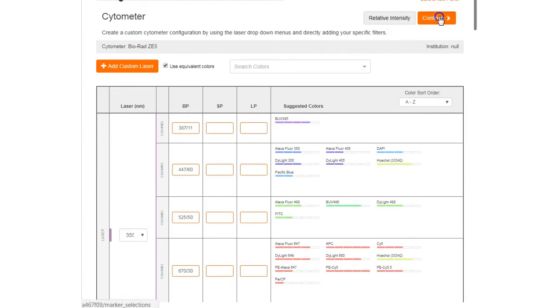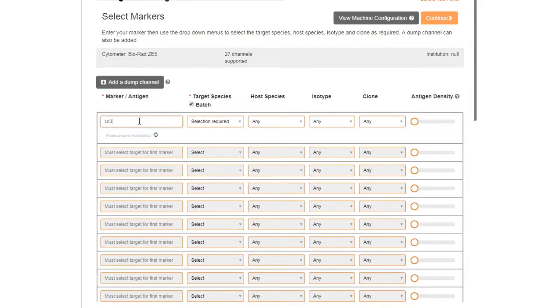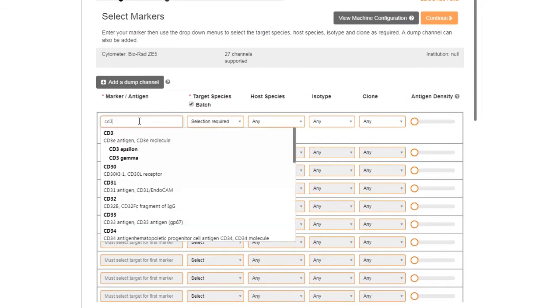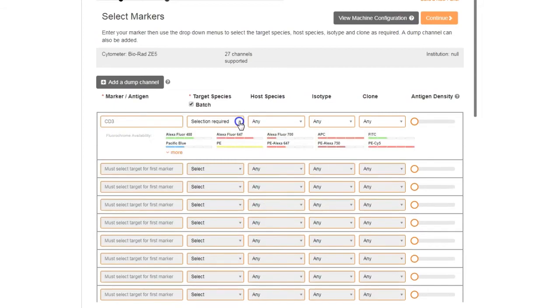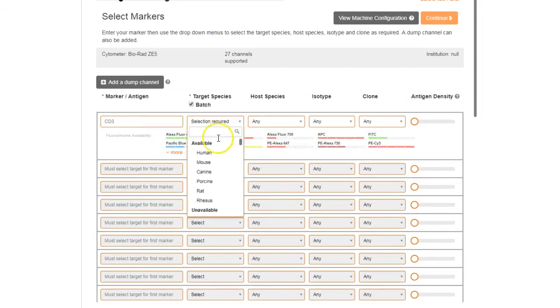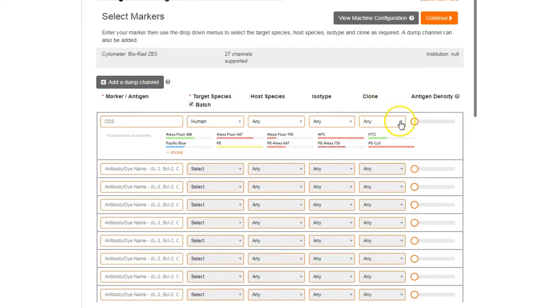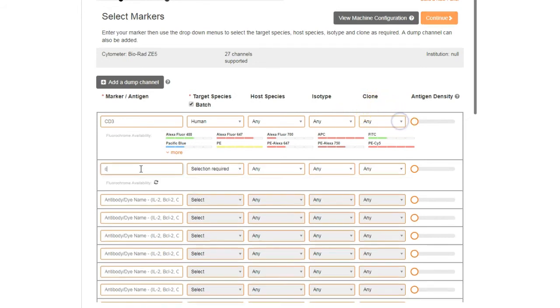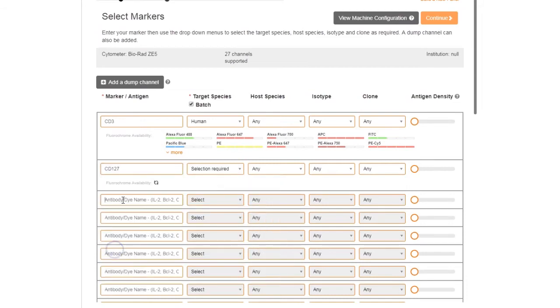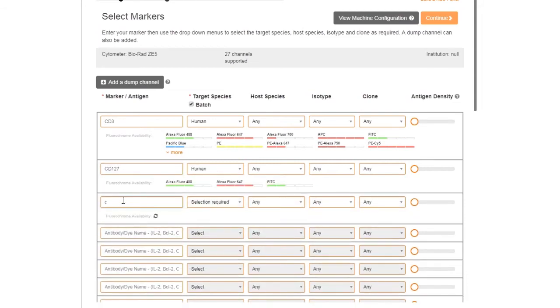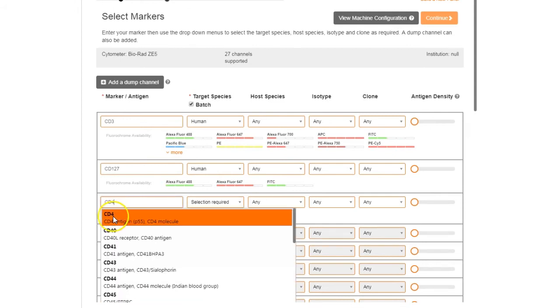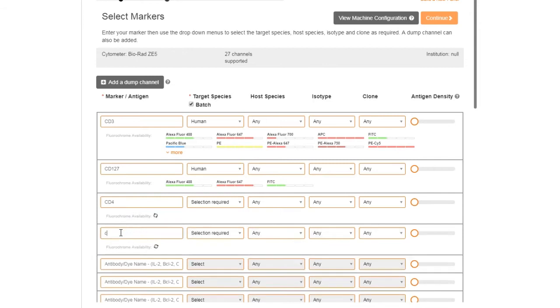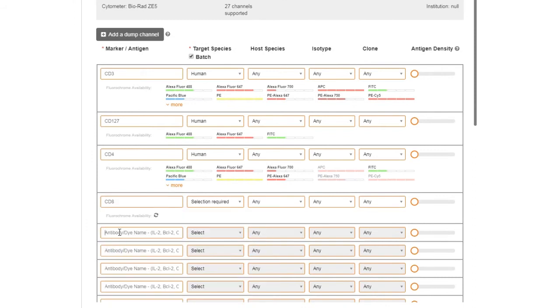Once you have chosen your cytometer, start selecting your markers by typing the name of your first marker. Choose your target species and refine further by host species, isotype, or clone. Add all of the markers that you want to include in your panel. All available fluorophore options are listed for each marker.